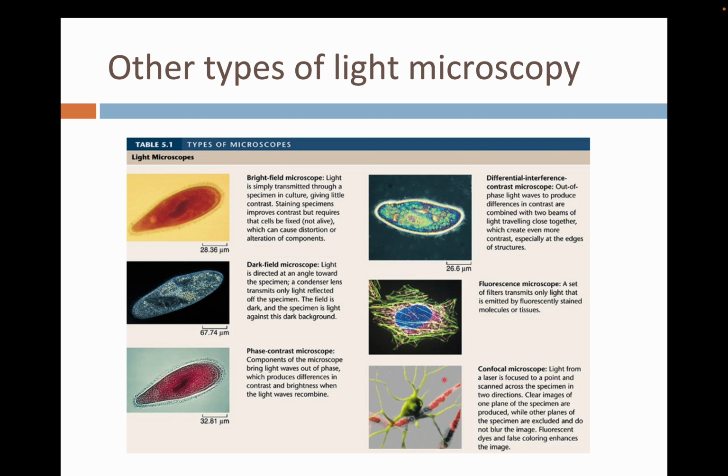Some of them are intended for observing the 2D rendering of your specimen while they are alive. Some of these types of light microscopy you use to observe certain functions in living cells. And some of them can also be used to identify localizations of cellular activity or prominent structures within the cell.